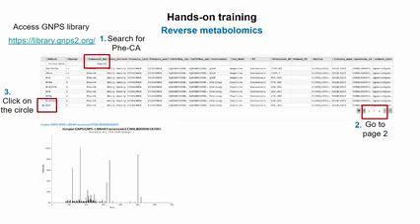Yasin can explain a little more, but the way the fast algorithm works, it selects the most intense peaks into specific bins, and in that case you're going to get, let's say, 6, 7, 8 matched peaks compared to, let's say, 14. But the way this algorithm works, it should still work. Yeah, because you're using cholic acid, so cholic acid will always give that 337.253. Yes. But if you're looking in your samples and you've got a low intensity of that spectrum, you really won't capture that ion.